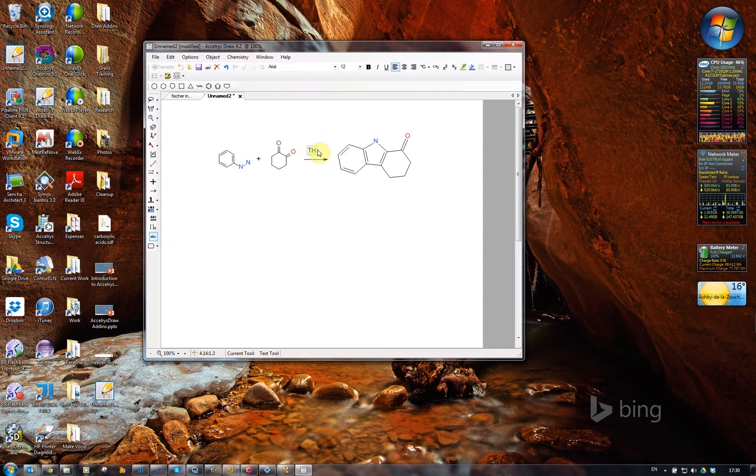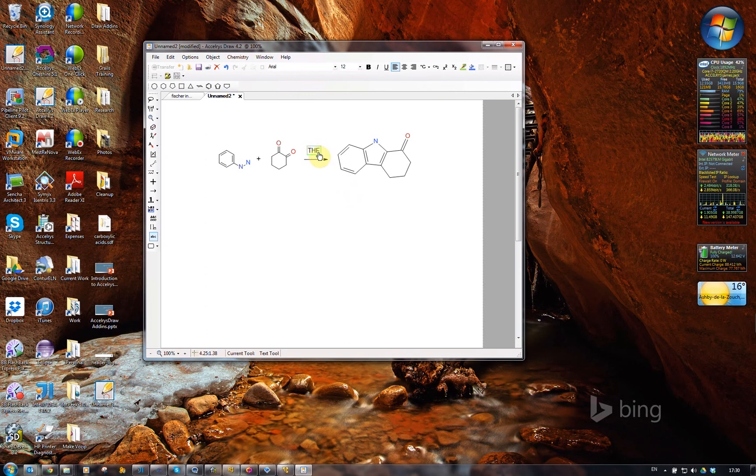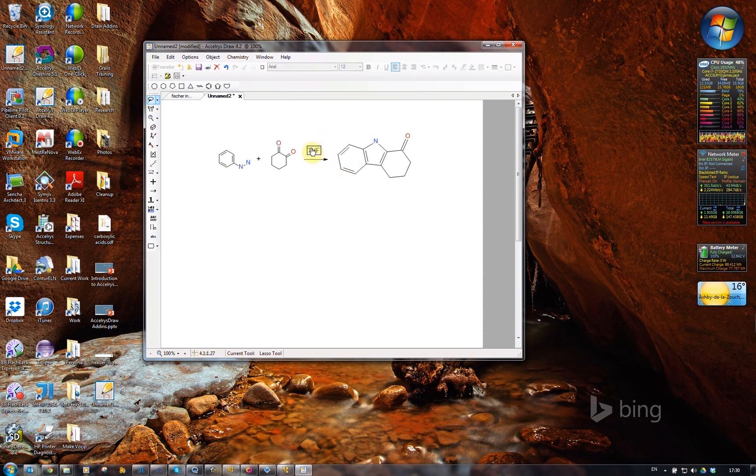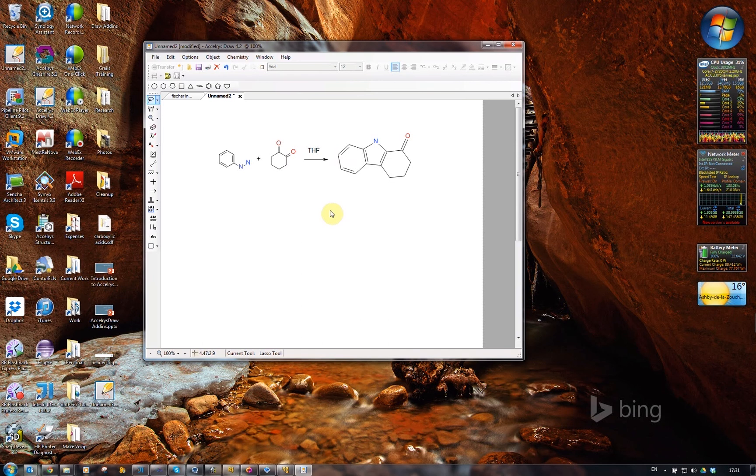I'm going to put THF. I'm going to imagine that this reaction is executed in THF. That's the kind of shorthand that a chemist uses when they're doing their day-to-day task. They might put reaction conditions and things like that above or below the reaction arrow, indicative of this being the solvent that's used to do this reaction. But when you're actually doing a reaction, you need to know how much solvent is needed.